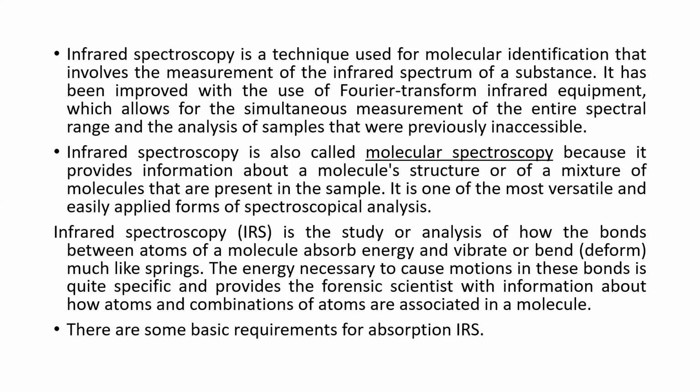So it talks about how the bonds between the atoms of a molecule absorb energy. So when you pass the light energy, that energy is absorbed by the molecule, and what is not absorbed is transmitted. But the absorbed energy is going to cause vibrations, right, in the atoms of the molecule.